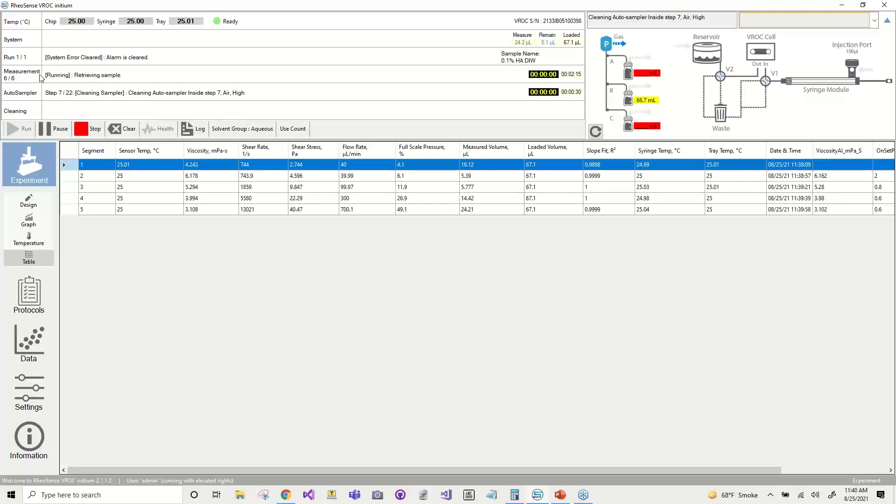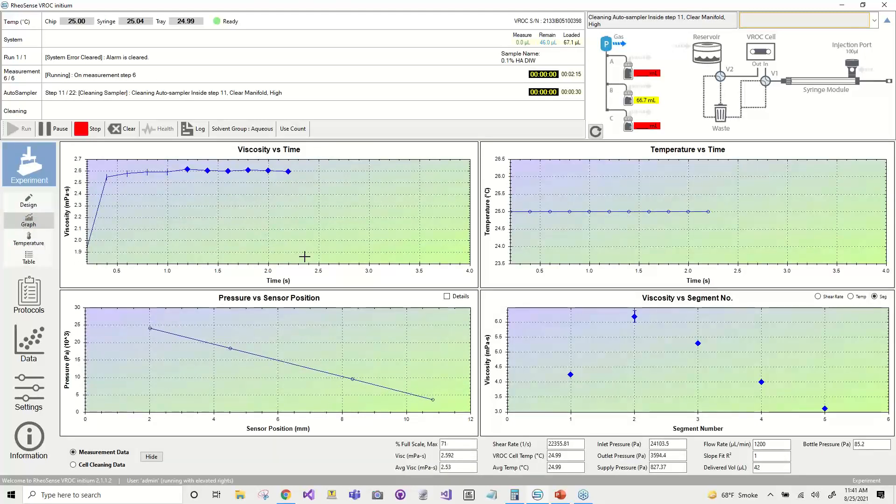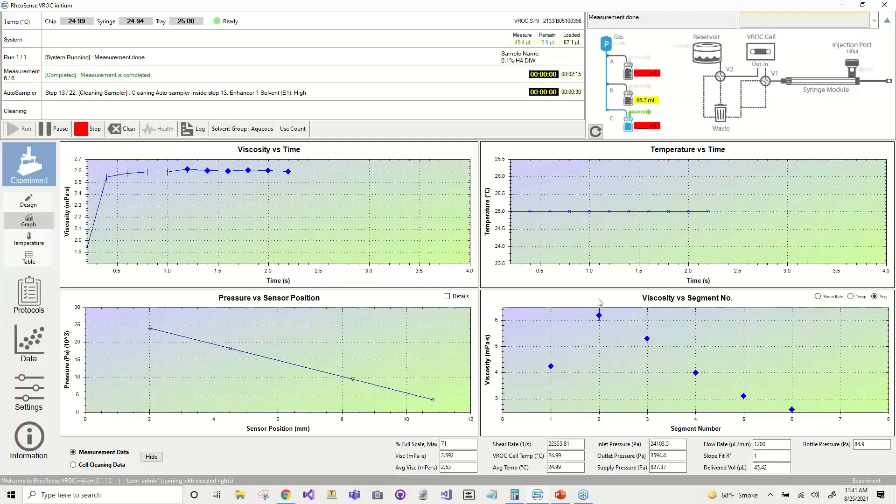Currently the system is telling us it's retrieving the sample. Just to jump back to sample retrieval — you can see here on the software that we only have 5 microliters remaining, and the system determined that wasn't going to be enough volume for the next segment. So it's running the system in reverse, bringing this pusher block backwards and pulling the sample back into the test range. Now we're back on measurement step six, running our last segment. Our viscosity is at 2.6 cP. It definitely looks like a shear thinning sample, which we can see in the viscosity versus segment graph. If we change this graph to display viscosity versus shear rate and ignore the priming segment, you can see a nice curve where the viscosity drops as we increase the shear rate.